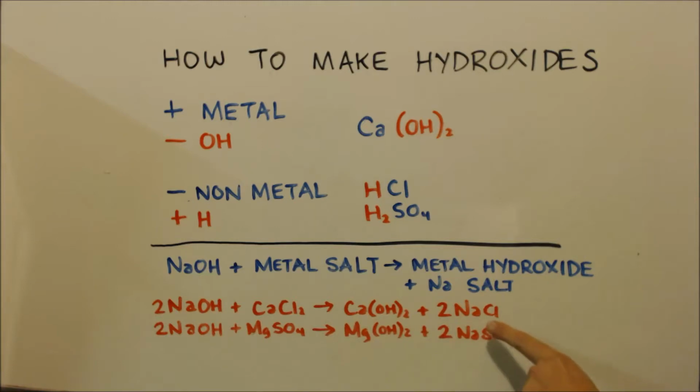This will precipitate out, this will stay in solution, and that's how they're separated. I mean, there's going to be a little bit, they are slightly soluble, most of these. So you have your 2 solutions of whatever salt you decided to make, because of whatever hydroxide you need. You mix them together, the hydroxide precipitates out, and this new salt stays in solution.